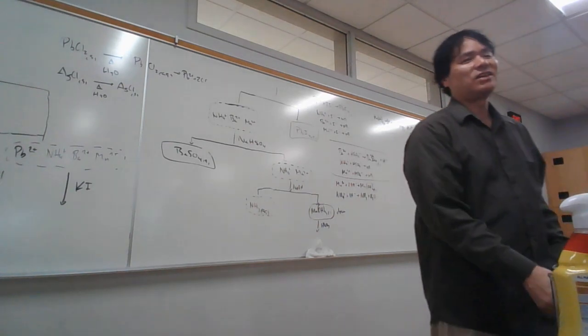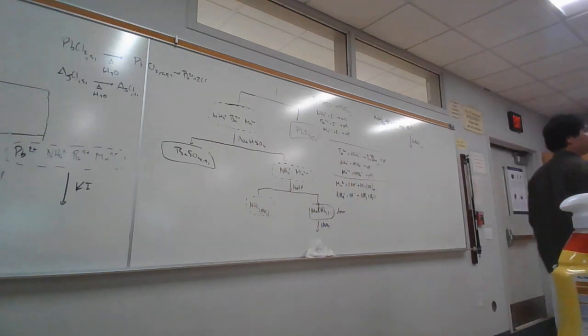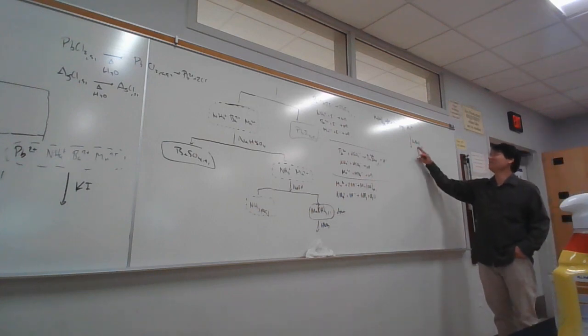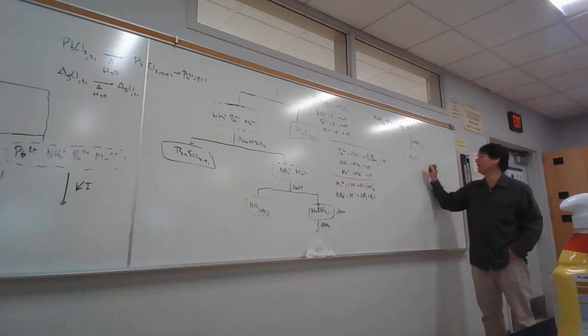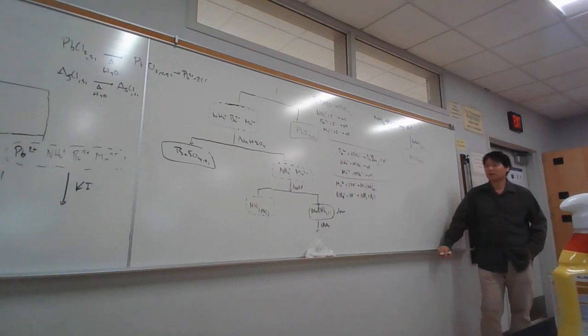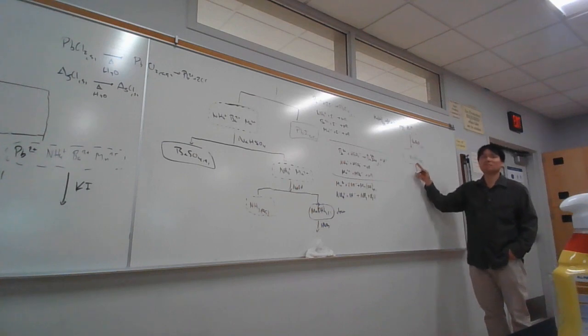Sodium bismutate is a very powerful oxidizer. It's dangerous stuff. And so, yeah, I'm going to move it into the hood in case the dust cloud forms and gets sucked into the hood, which would be better than breathing it in. Sodium bismutate, it's a sodium salt, so it's going to dissolve. And what we should get is a purple liquid, and that purple liquid is going to be permanganate, aqueous. It's not a precipitate. Sometimes people add a lot of this and they think they get a precipitate. There's no precipitation in this step. It's just converting this one, which is almost colorless, to a deep purple color. This one, manganese 2 plus, is light pink, and it's really hard to see. This one's really easy to see.